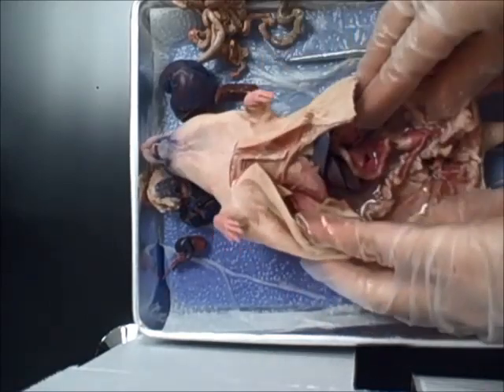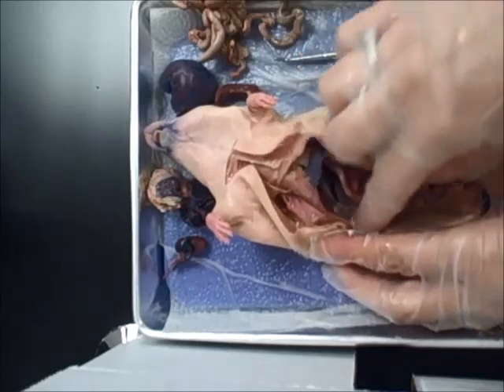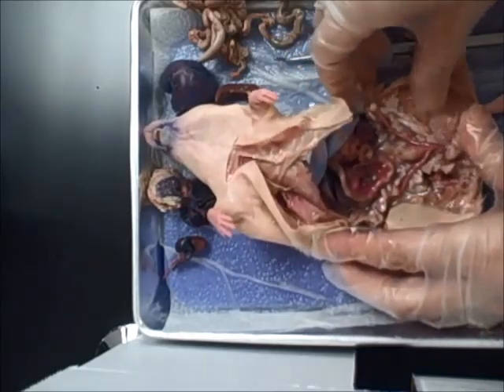All right, and so there is the female rat. Once again, it has the horned uterus instead of a pear-shaped uterus.